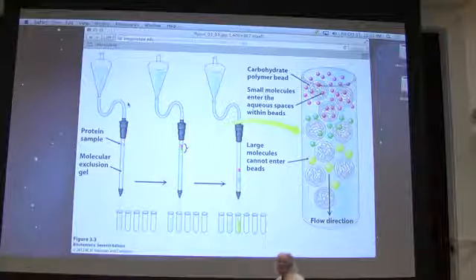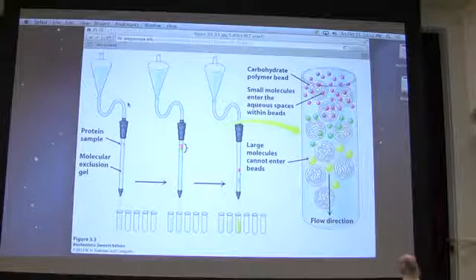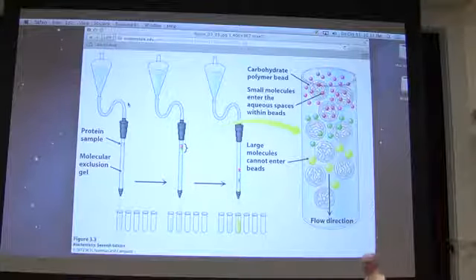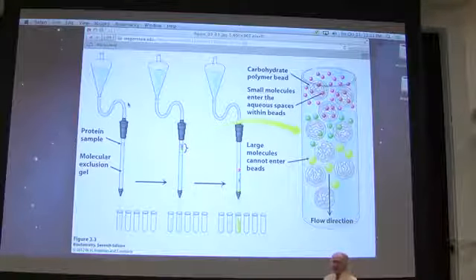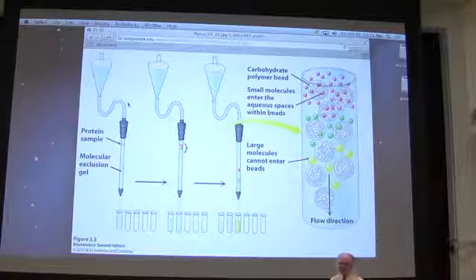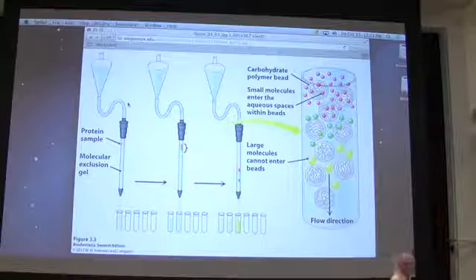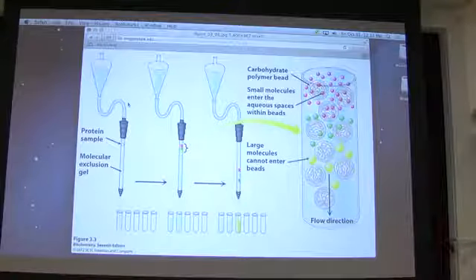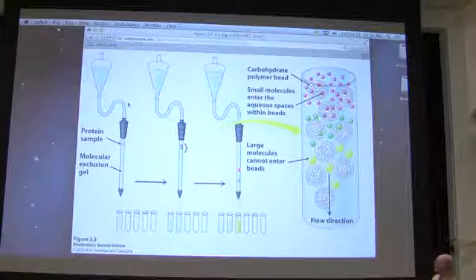Yes? You'd only be able to separate them as a group. Well, not completely. His question was, can I only separate them into 2 groups. I've sort of drawn this so that we can imagine they're coming off actually in 3 groups. And so that's basically what you'll see. You'll see a group that comes through fairly fast, a group that comes through less fast, and a group that comes through the slowest. Okay? So roughly 3 groups. Yes? Is it fairly clear to tell when you're transitioning from one to another? Only if you have colors like these.